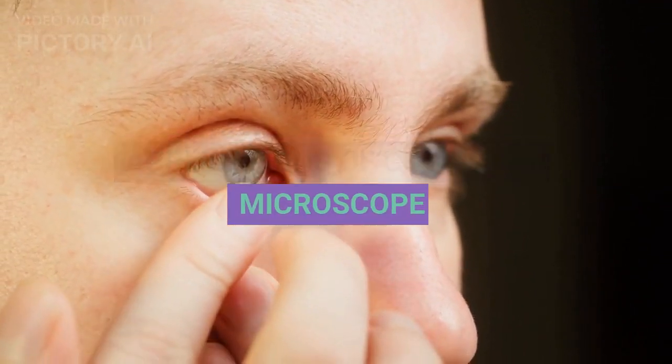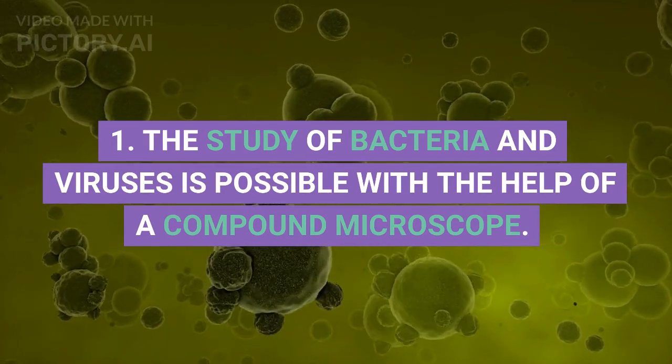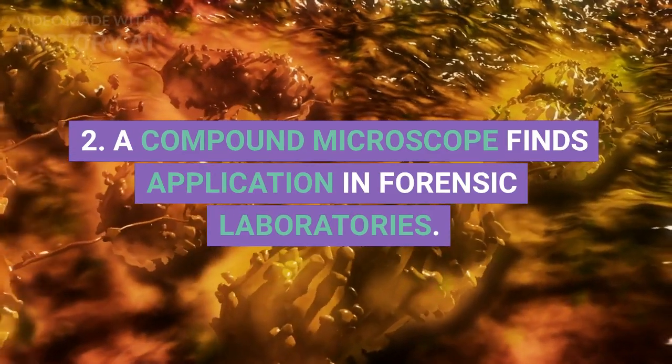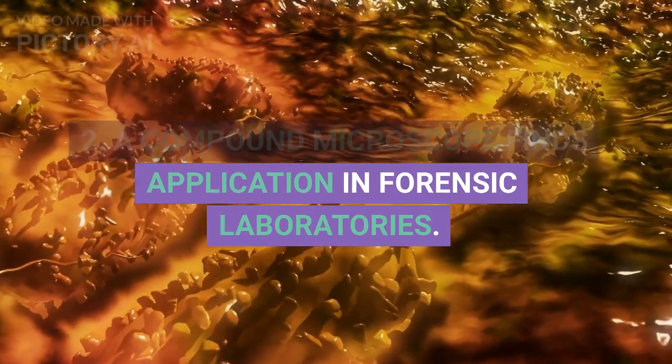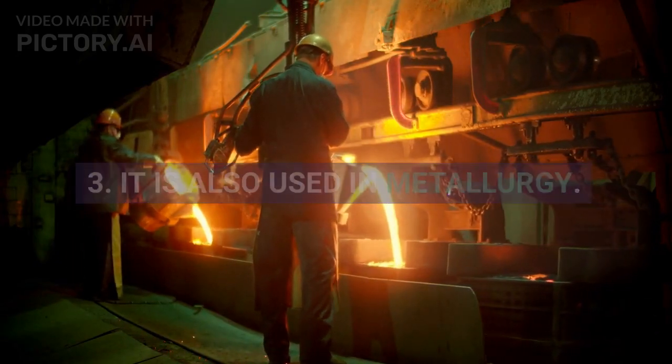Applications of compound microscope. 1. The study of bacteria and viruses is possible with the help of a compound microscope. 2. A compound microscope finds application in forensic laboratories. 3. It is also used in metallurgy.